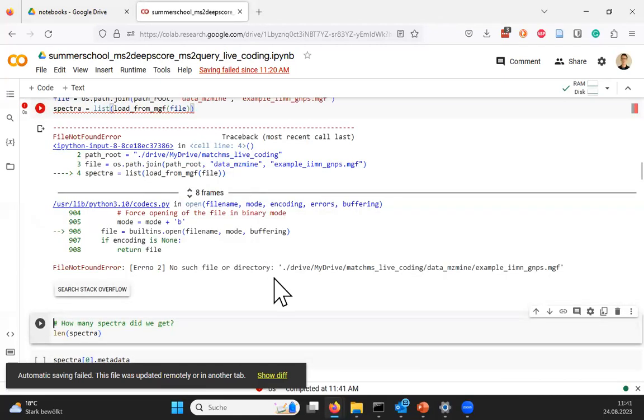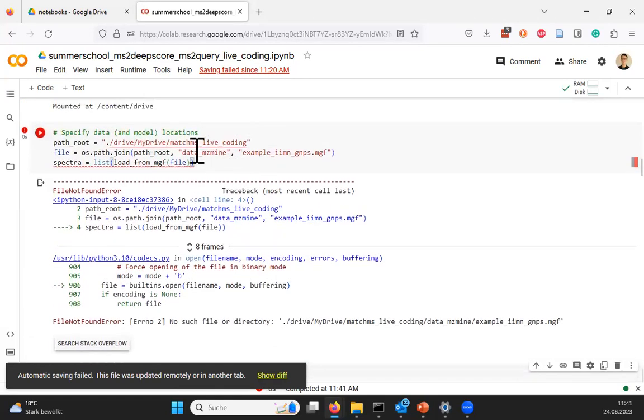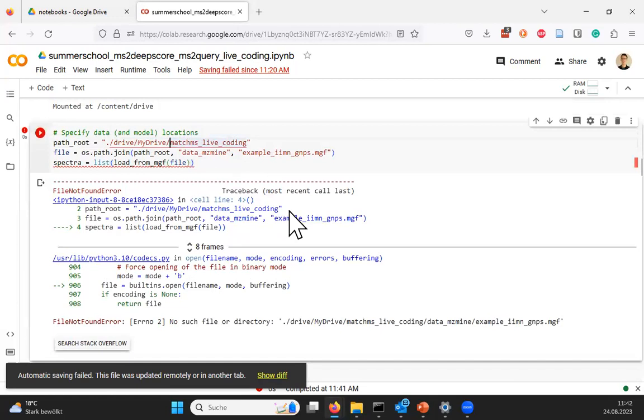Oh, sorry, I think there's still the... Oh, yeah, I have it wrong. I'm in the right notebook here, I hope. Otherwise, I'll destroy it. Just check it's in the right drive.